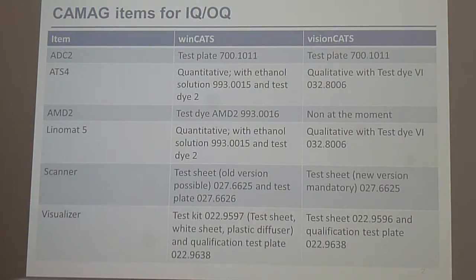The thing is really that if you have an item without expiration date, some guy will ask you how old is it and is it still valid. This is not one week, this is usually one year.